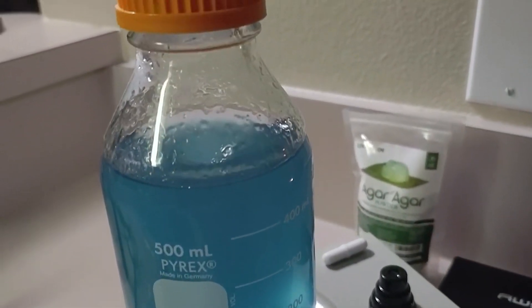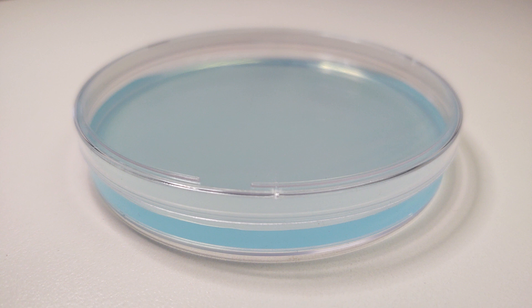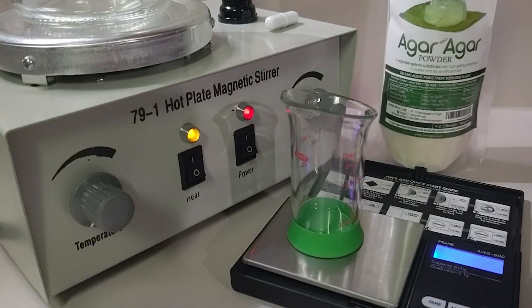You may have seen our water agar video where we share our base recipe. It is simply our go-to agar and boiling purified water.